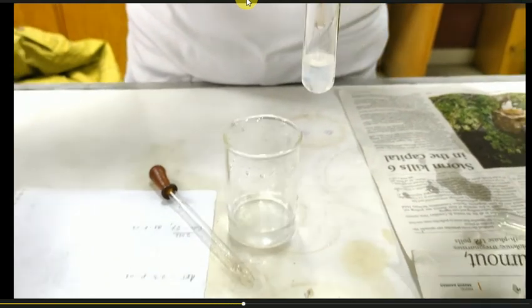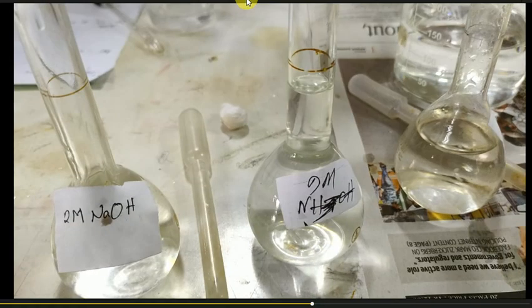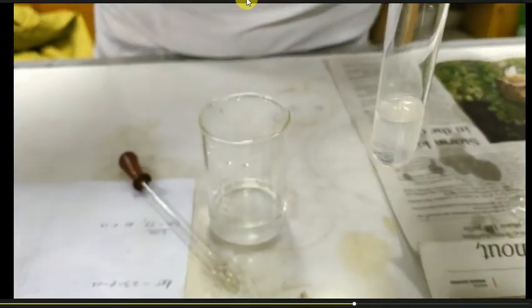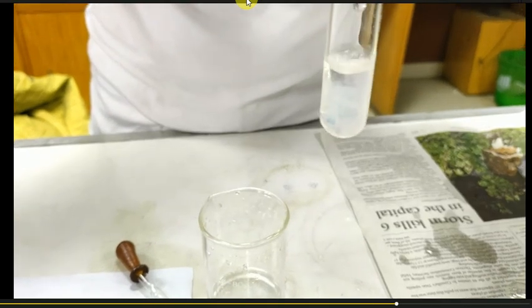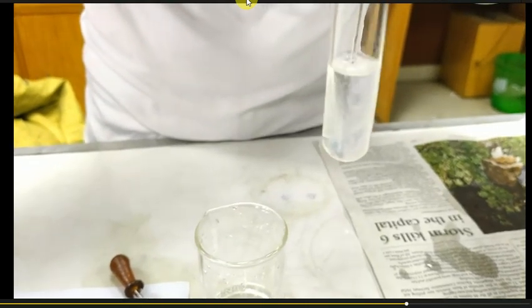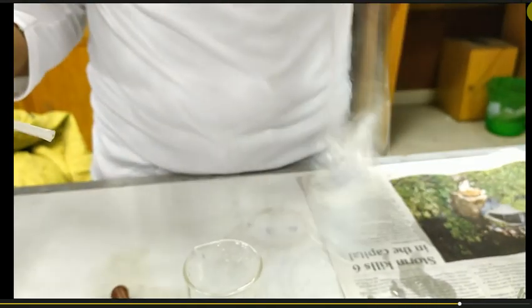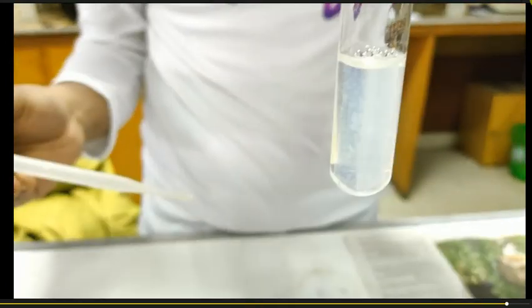Now in this case we are going to add 9M ammonium hydroxide to this precipitate. The precipitate doesn't dissolve. This is indicative of the presence of aluminum ion, and this also confirms the presence of aluminum ion.